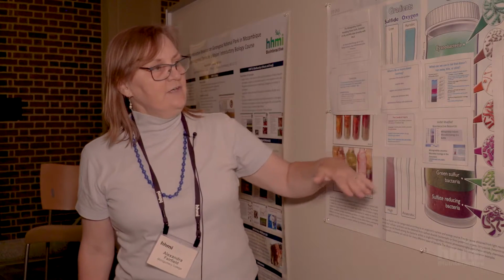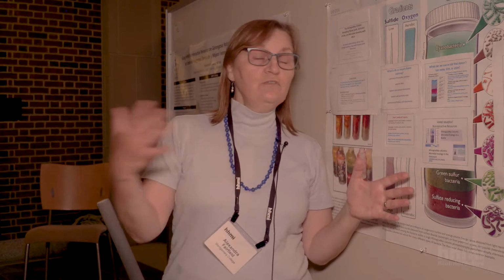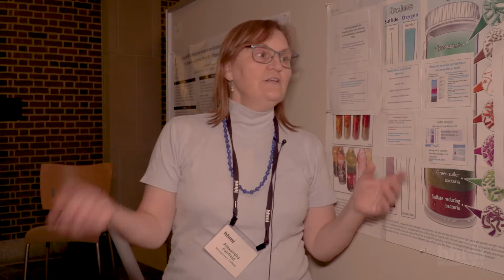They're responsible for making observations every week in lab. And in the meantime, we are doing other lab activities while these Winogradsky columns are cooking along. The next unit is microbial life. So many of these students do not go on to take microbiology, so I have them learn basic culture and staining techniques. They also will learn later identification of protists when we go into eukaryotes.